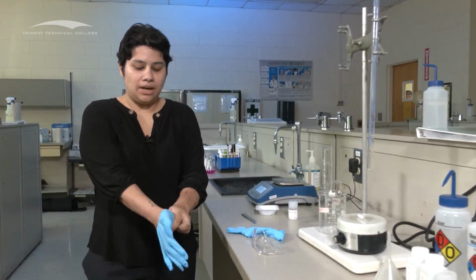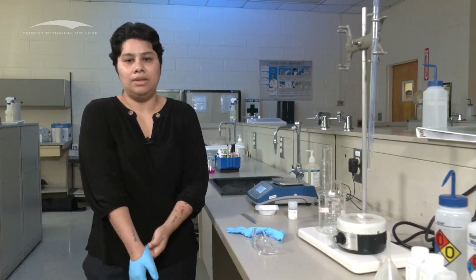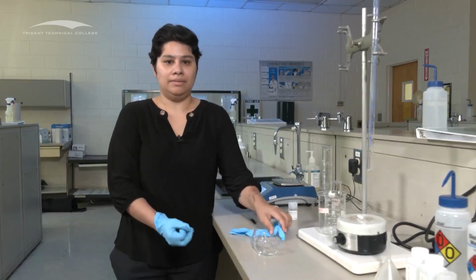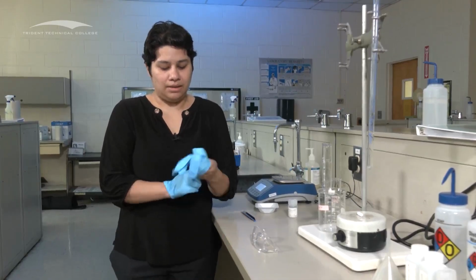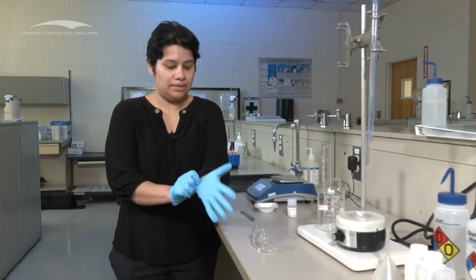And I want to start by refreshing you on how to weigh. You haven't really weighed powders that much. Make sure that we're not eyeballing it. And then put our gloves on, put our goggles on. If you are allergic to latex, I highly recommend you bring your own gloves.